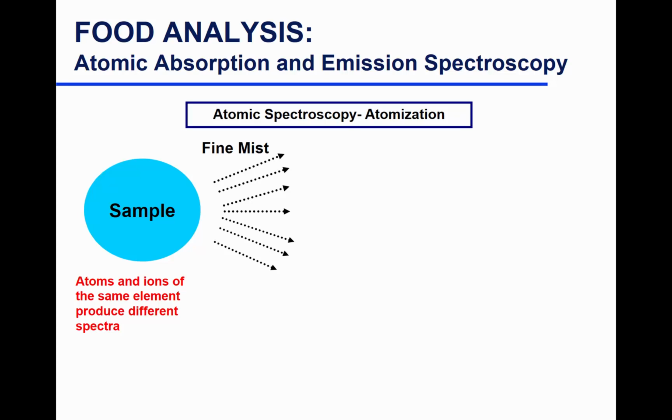So in atomic spectroscopy, when your sample is in solution, when your minerals are in solution, the very first step is to aspirate that solution into fine mist.